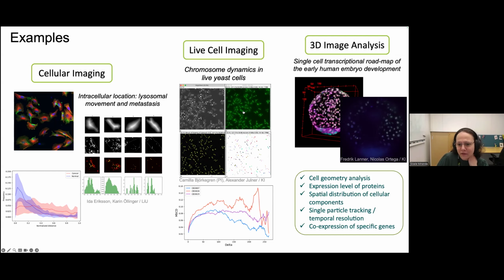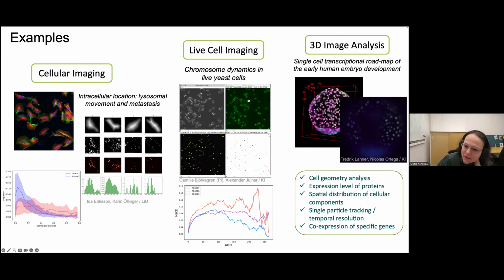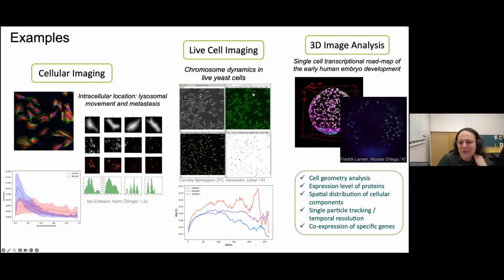And here, I don't know if it's possible for you to see, but the shape is like a line. So we were able to track and then segment, and here is the reconstructed dynamics. And then you can extract, for instance, measurements like displacement over time or average distance.